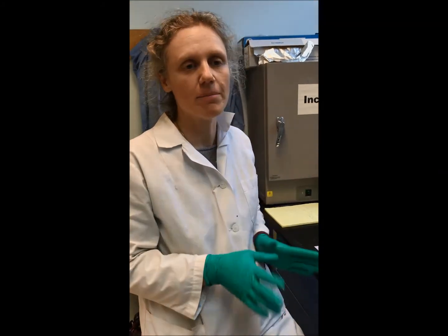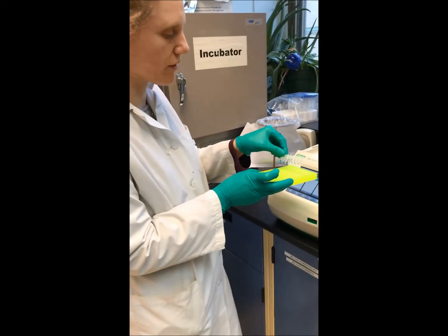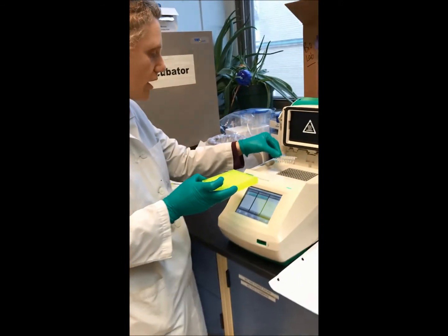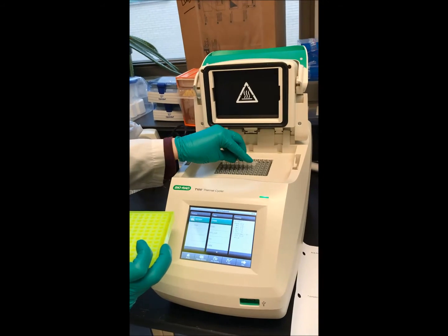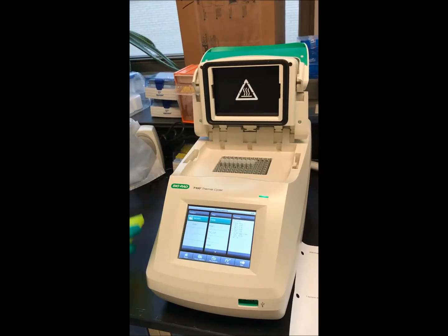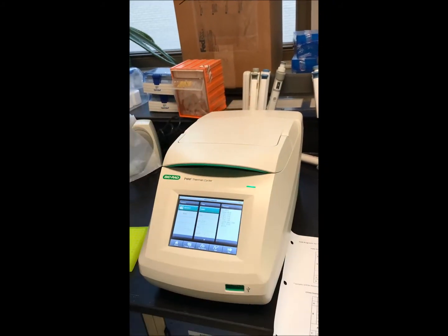So it will do the job for me, and then tomorrow morning I can come back and analyze my DNA samples. There you go. So here are my PCR tubes where I put all the ingredients. Now this is the thermocycler, and I'm placing my PCR tubes in it, in those little slots. And I guess I'll have to close the lid, close it tight.